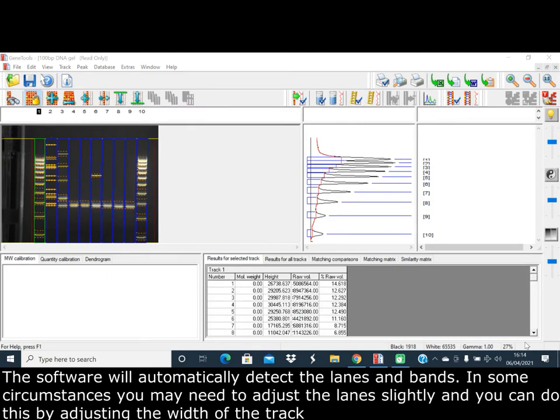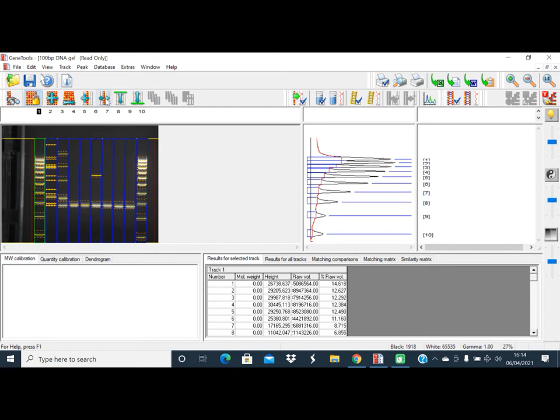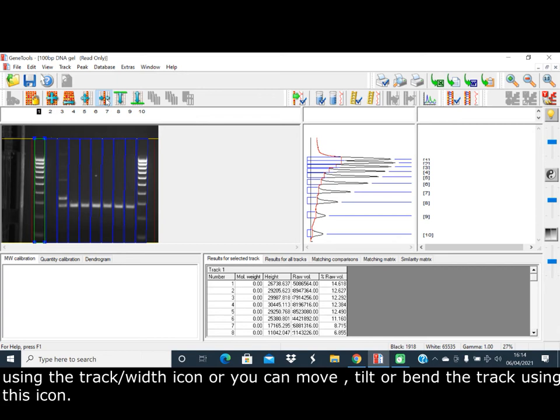The software will automatically detect the lanes and bands. In some circumstances, you may need to adjust the lanes slightly, and you can do this by adjusting the width of the track using the track width icon.